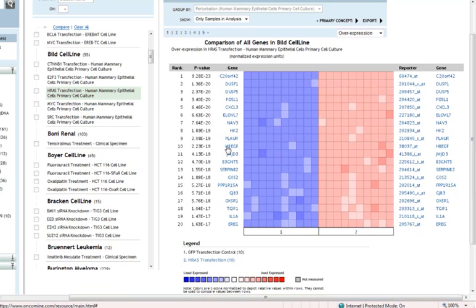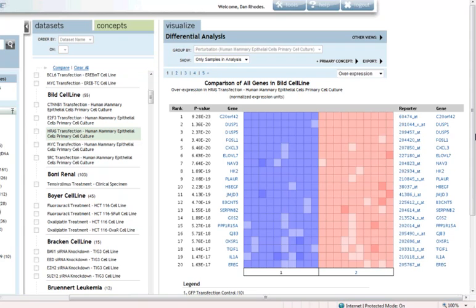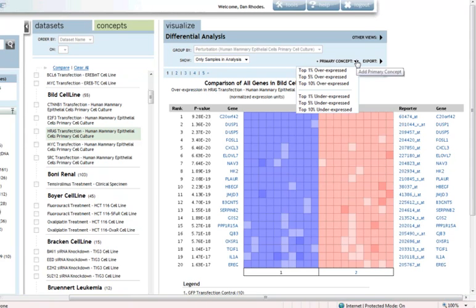We could just dig through this heat map to identify single gene markers of RAS pathway activation. But instead, what I'm going to do is what we call a concepts analysis, and that's just like a gene signature analysis that you might have done in other tools.